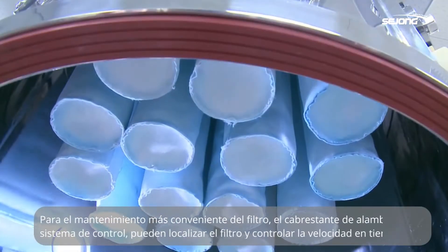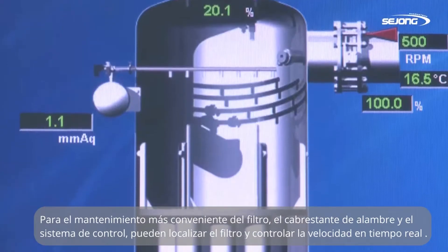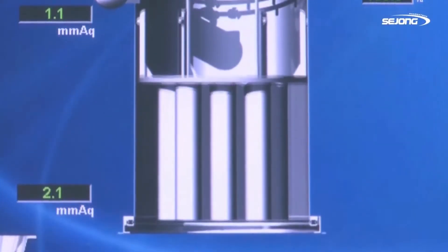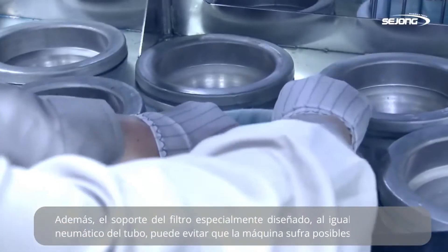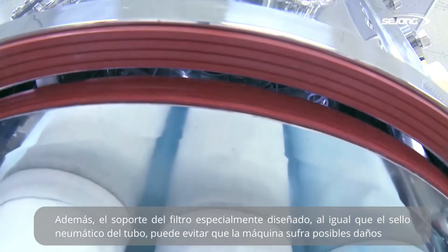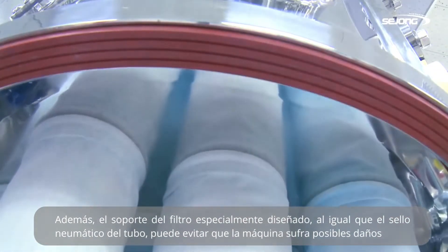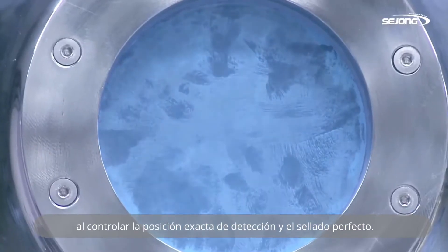For more convenient maintenance of the filter, the wire winch and control system can locate the filter and control the speed in real time. In addition, the specially designed filter bracket, just like the pneumatic tube seal, can prevent the machine from possible danger by sensing position and sealing perfectly.